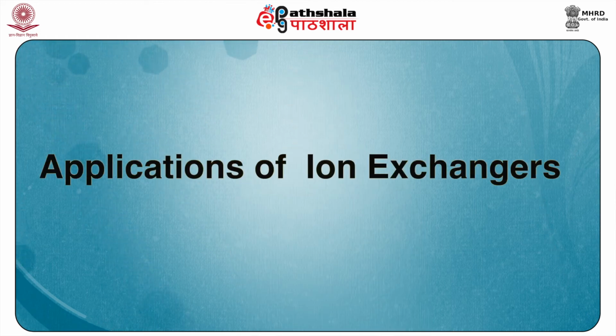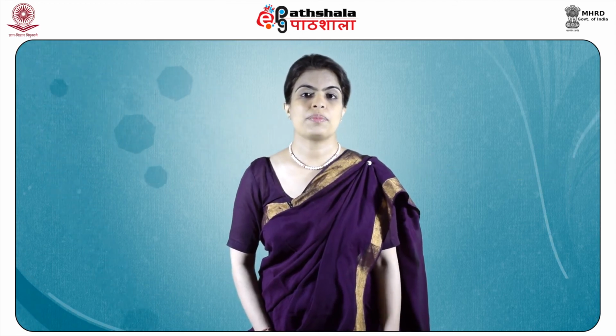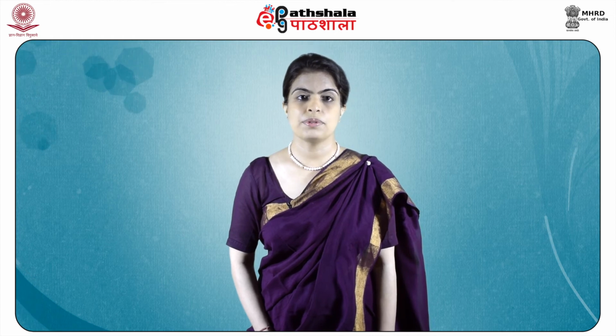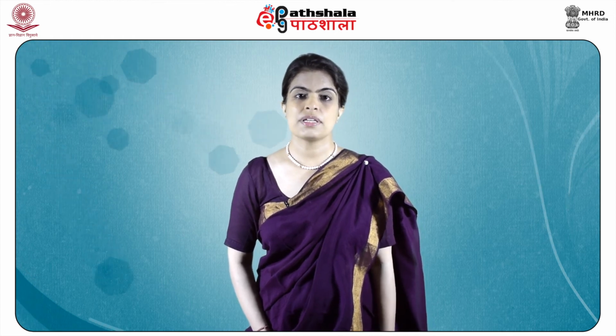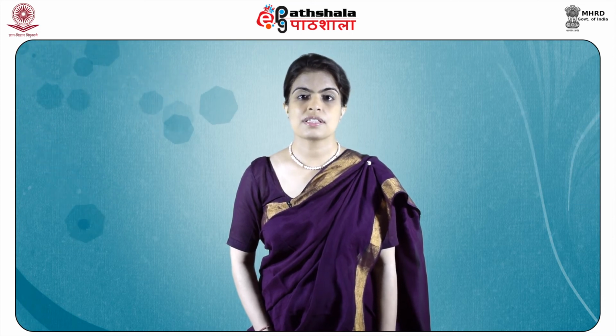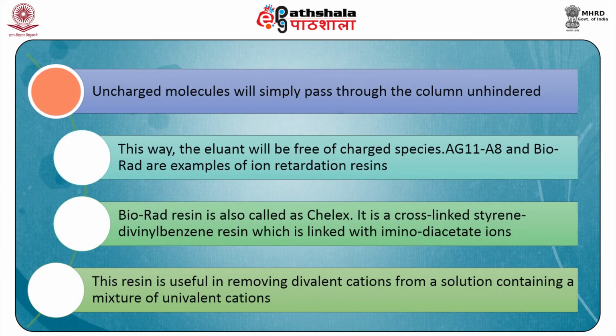Now we'll discuss the applications of ion exchangers. Ion exchangers, besides being used for separation of macromolecules, also have other interesting practical applications. For example, desalting. In order to separate ionic species in a sample, a solution of macromolecules, ion retardation resins can be employed. Such resins contain both negatively and positively charged groups and can therefore remove both cations and anions. Uncharged molecules will simply pass through the column unhindered.